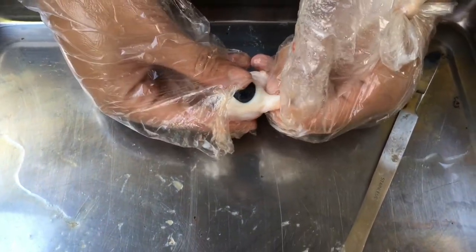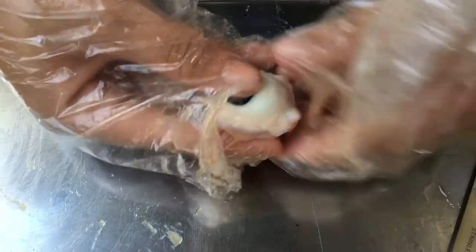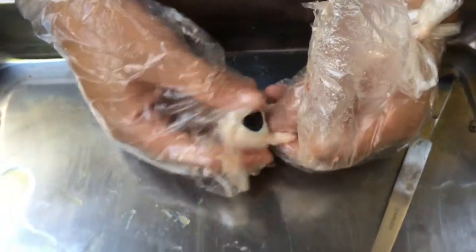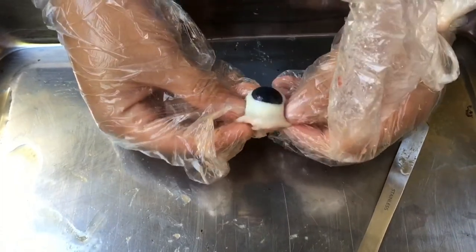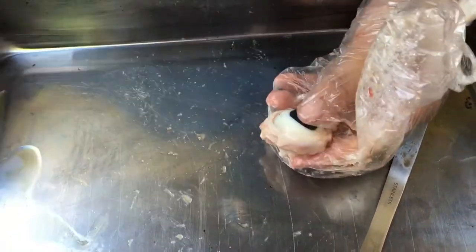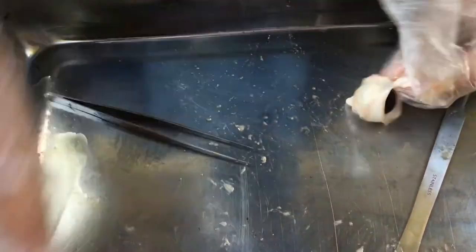The part you can see is the outside of the eyelids, and the pink tissue is the extraocular muscles that are attached to the bottom side of the eye to move the eye up, down, left, and right, and its eye sockets. So, I'm going to trim this part to see exactly what we are looking at. I'm going to cut this.